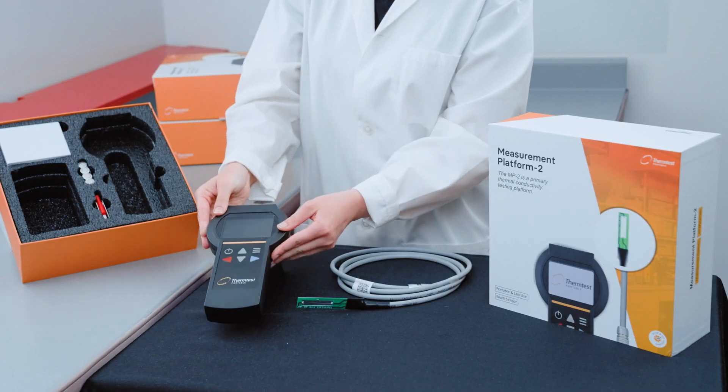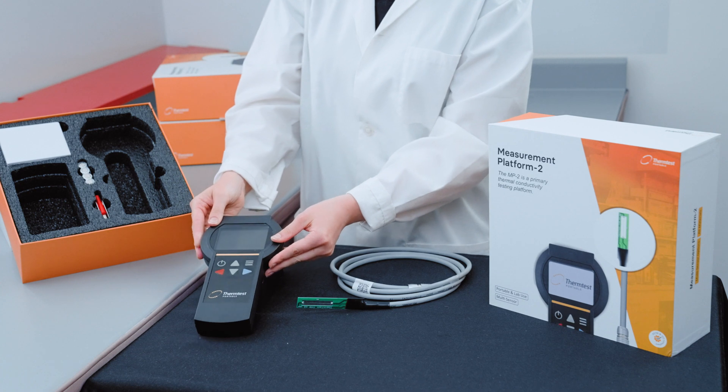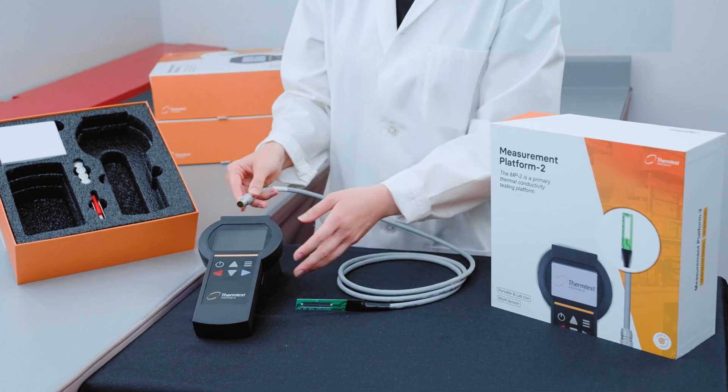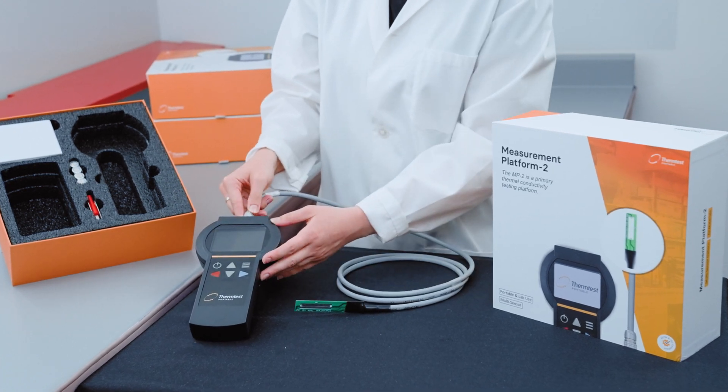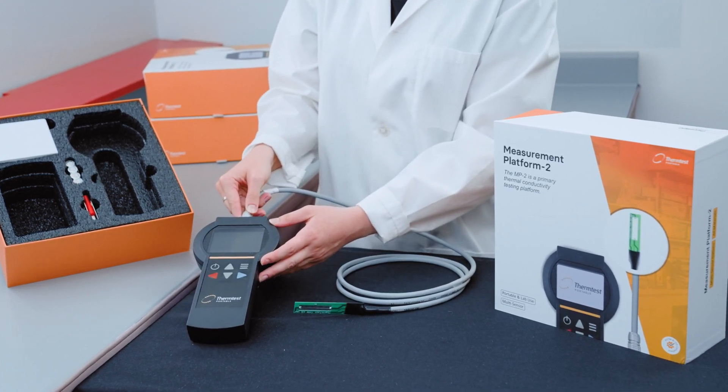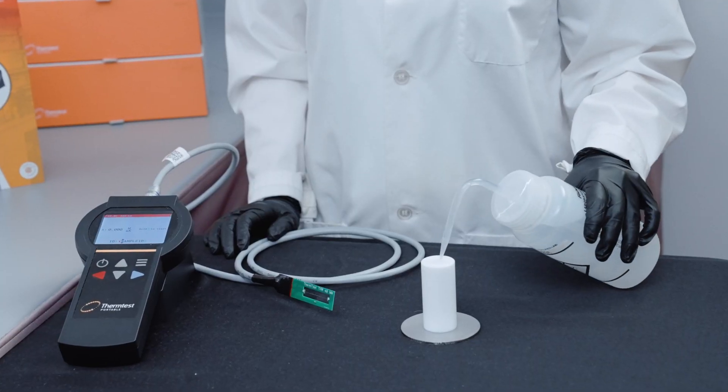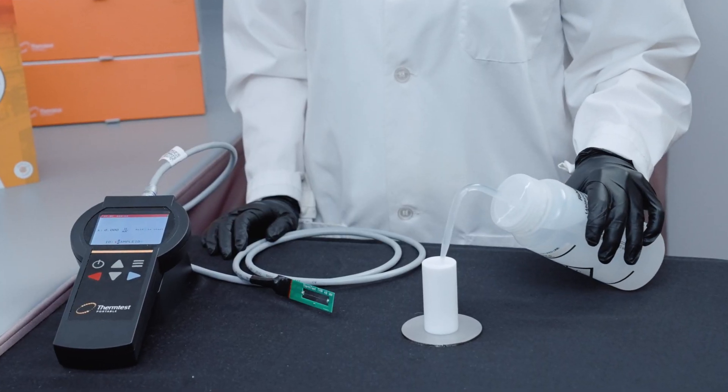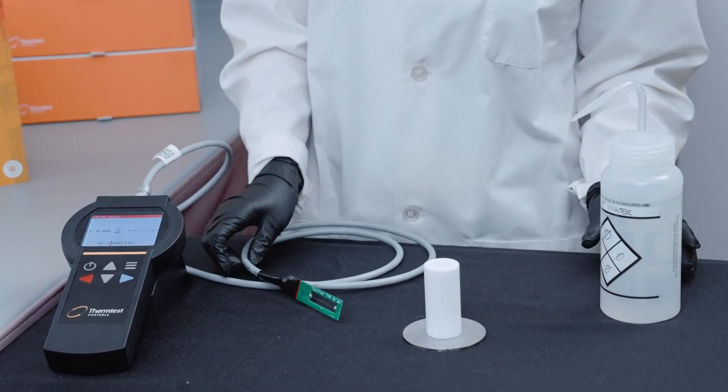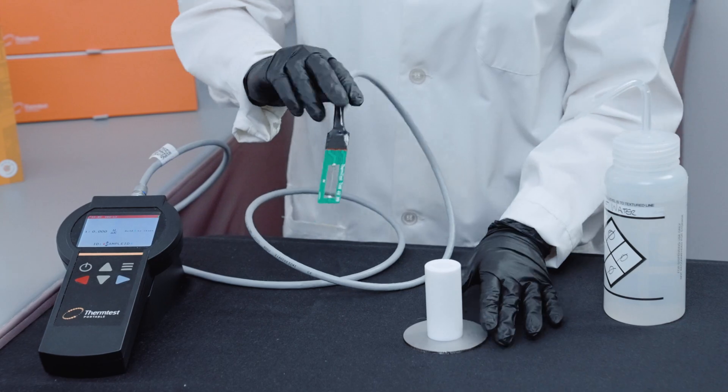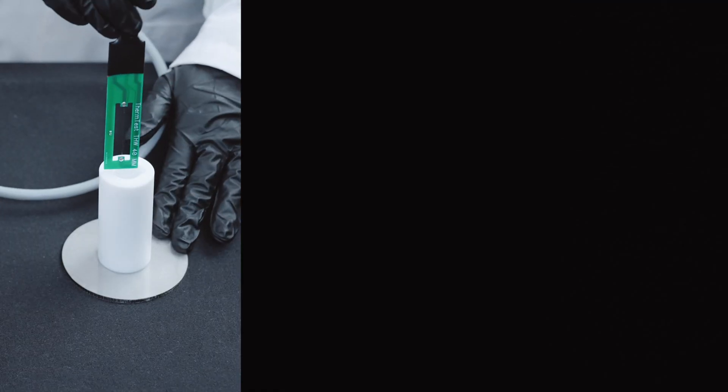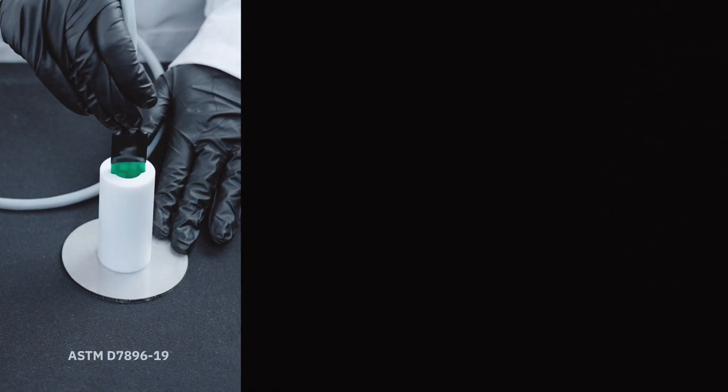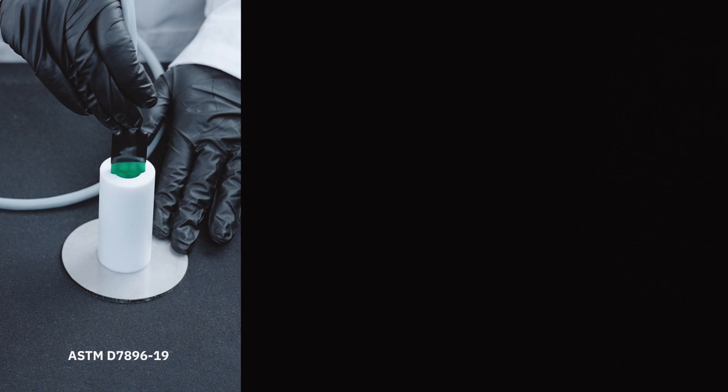The transient hot wire sensor is designed for primary measurement of thermal conductivity for liquids and pastes. Approximately 15 milliliters of liquid is poured into a sample cell and the THW sensor is inserted. A short test time of one second ensures results are free of convection.